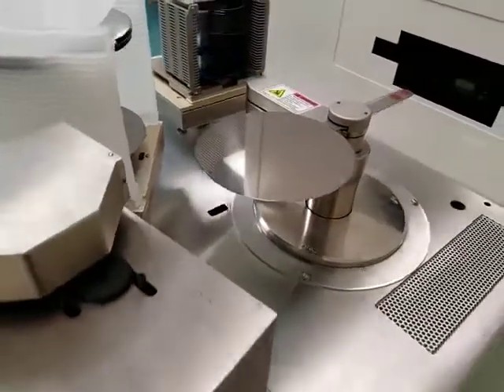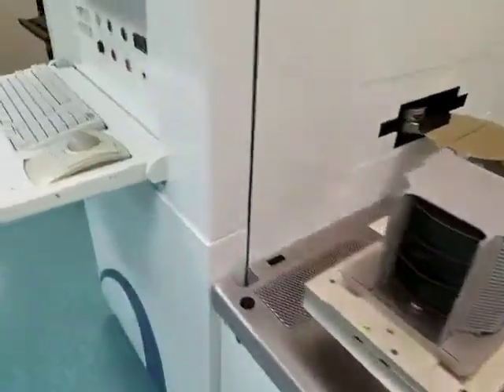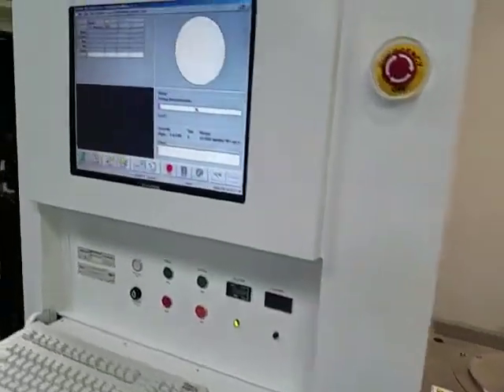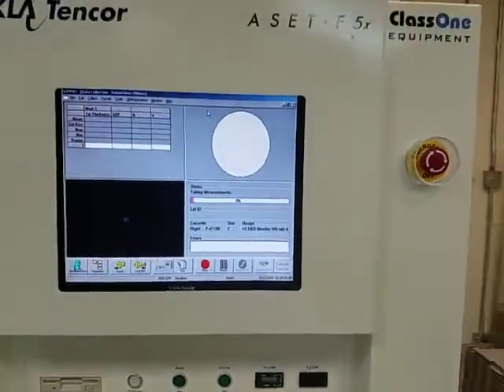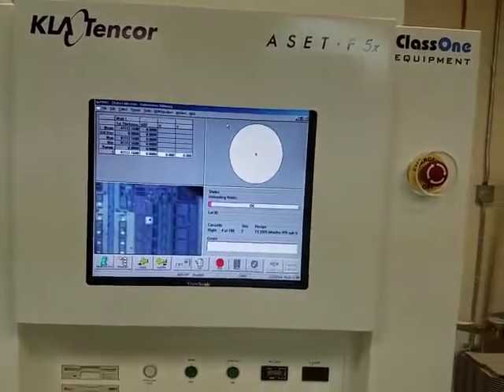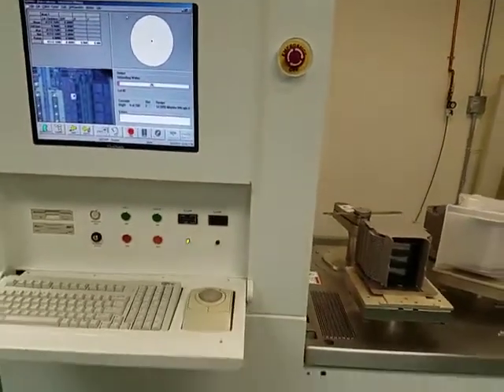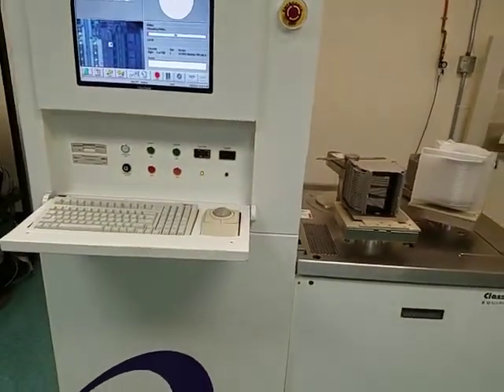Optical assemblies have been thoroughly checked, replaced or repaired as needed. Old LCD monitor has been replaced with a brand new LCD monitor. DBS and SE calibrations are done with calibration wafers. Machine covers are cleaned.